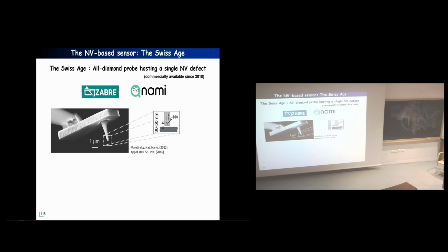But this is not 15 euros. You killed my joke. This is the only way you can hear me saying, don't change the tip, try to save it, because it costs 3,000 euros. Switzerland. Diamond from Switzerland, okay?